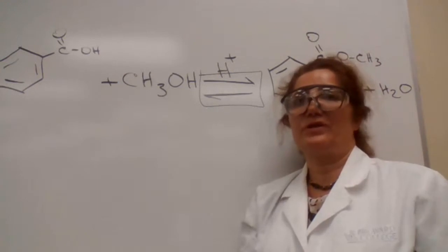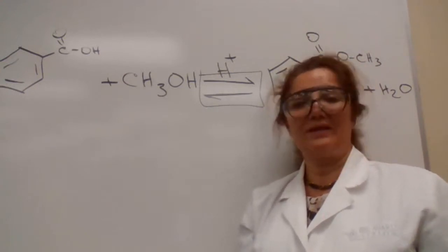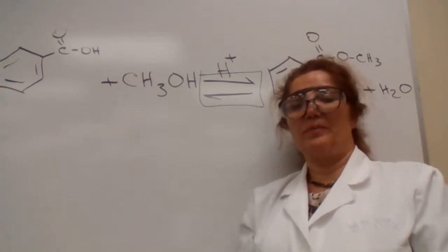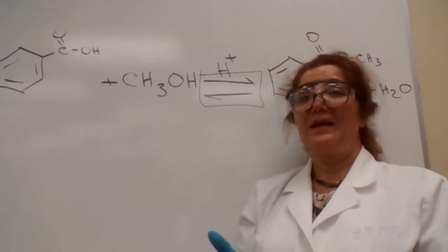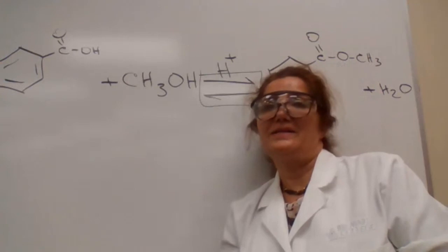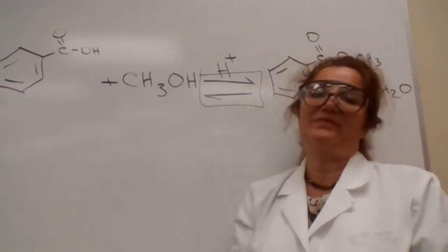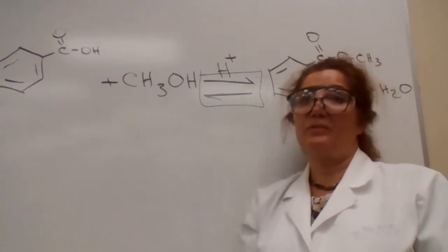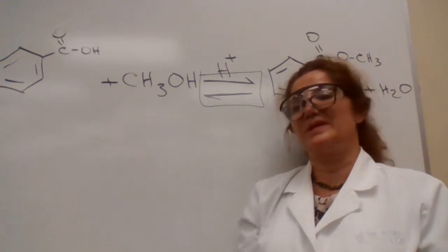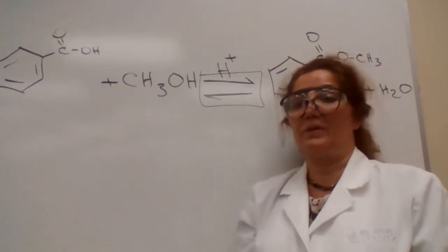What would be the temperature in the boiling flask at this point? It's boiling and it's constantly boiling. It would be equal to the boiling point, or approximately the boiling point, of the solvent. The solvent that we are using now is methanol, and methanol boils at 65 degrees Celsius. Since pure methanol boils at 65 degrees Celsius, and we added benzoic acid to it as an impurity, it could go to like 70 degrees Celsius, but it's not going to be much higher than that.